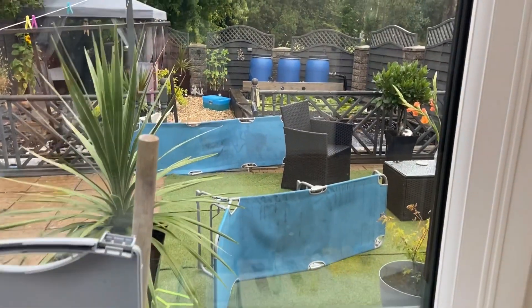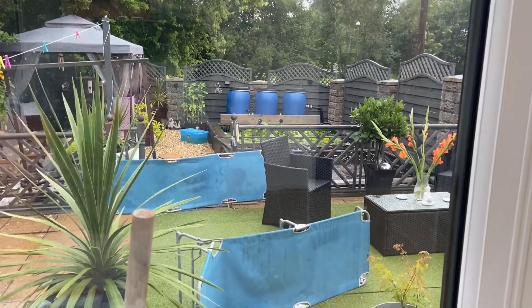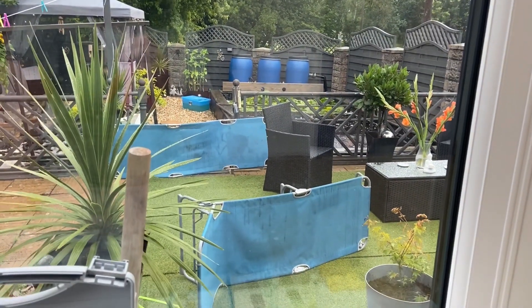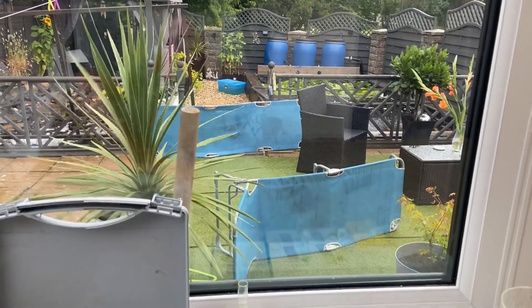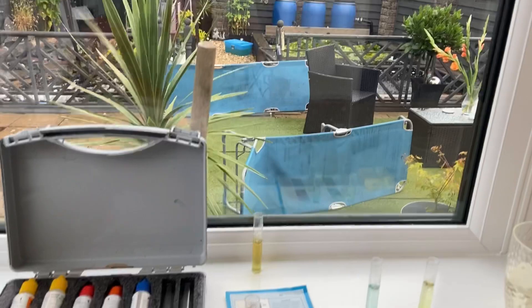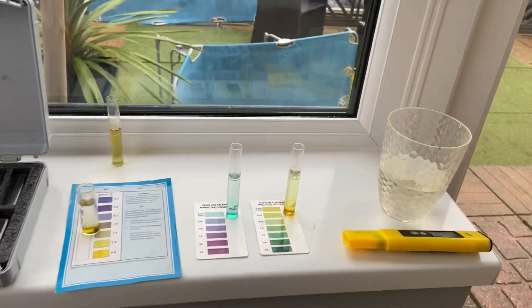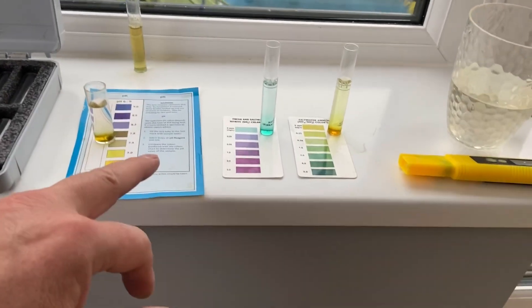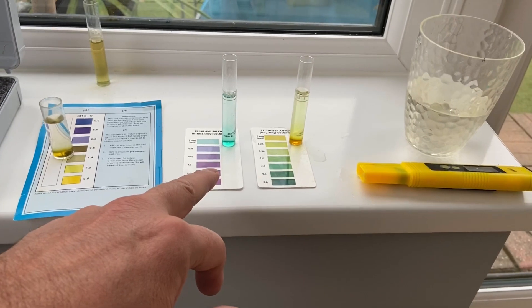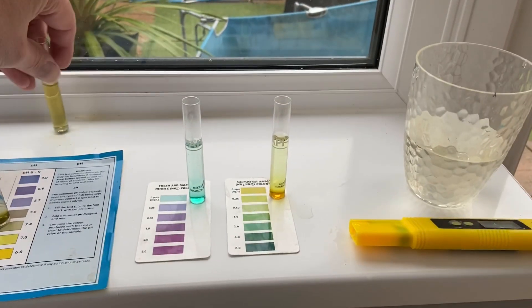Evening guys, it's a bit of a wet old evening — it's been raining quite a bit. I thought I'd check my pond parameters; I tend to do it weekly. So I've checked my pH, my nitrite, my ammonia, and my KH.